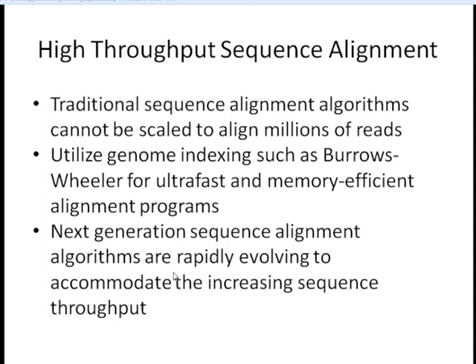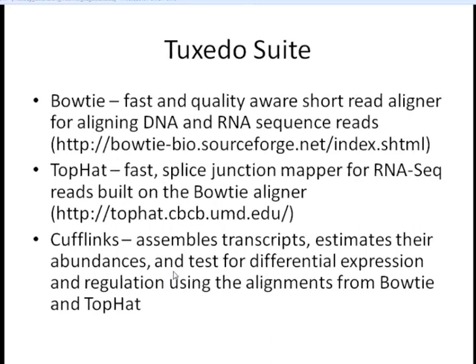This is a public service announcement: next-generation sequencing alignment algorithms are changing very quickly, and they're evolving to keep up with the rate at which sequence throughput is increasing. We'll go through some programs today, but I would highly suggest looking into the literature when you need to do this in the future, because these ones may not be the most ideal at that time.